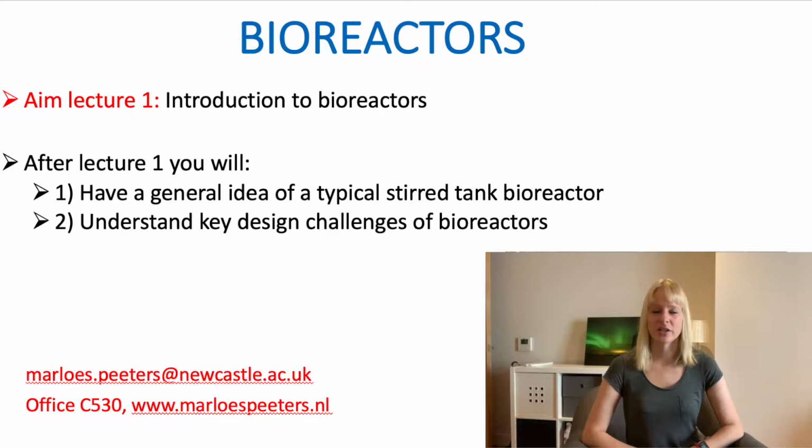Now, in this first mini lecture, there are two key things you will need to remember. The first thing is about how diverse bioreactors are. So how would the design of a typical stir tank bioreactor look like and how that might differ from a normal reactor? And the second is some of the key design challenges that are associated with bioreactors. And we'll go into more details in the lectures coming after this.